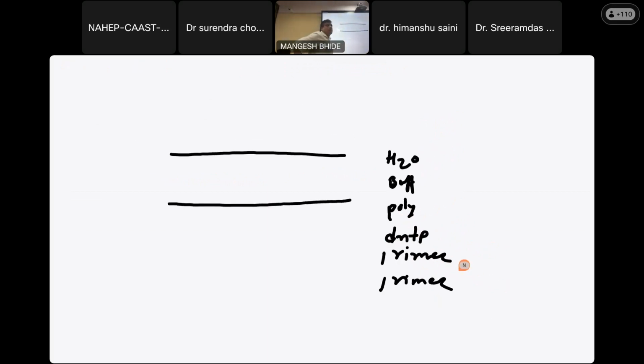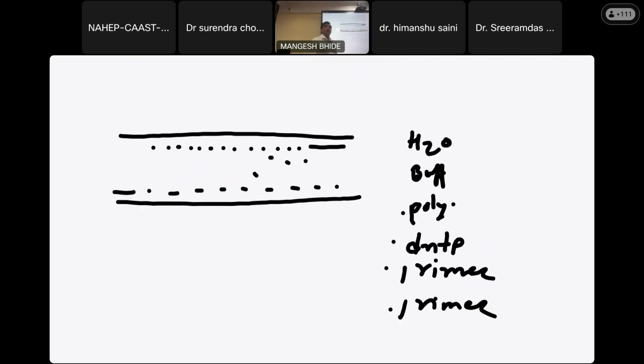This is a classical approach where, one by one, the DNA will be denatured, so there will be two strands. The forward primer will sit here, the reverse primer will sit here. Then dNTP will come into the picture. With the help of polymerase, it will start to fill in and extend. This is the classical approach of PCR, right? Each and every component is used up in the classical PCR.